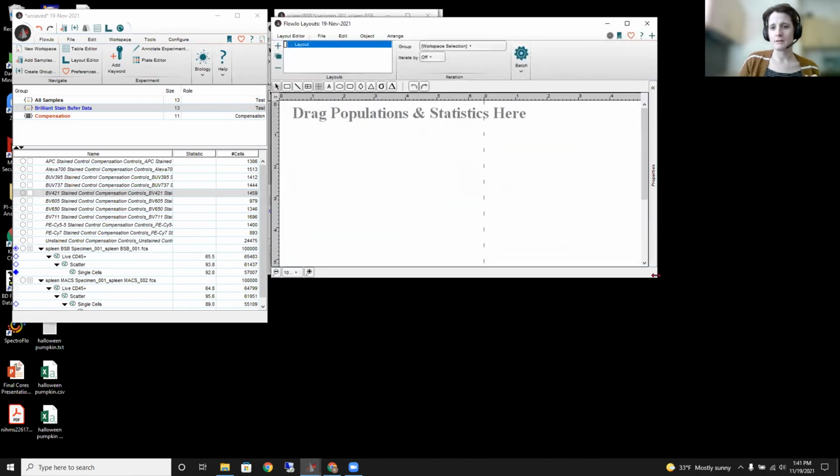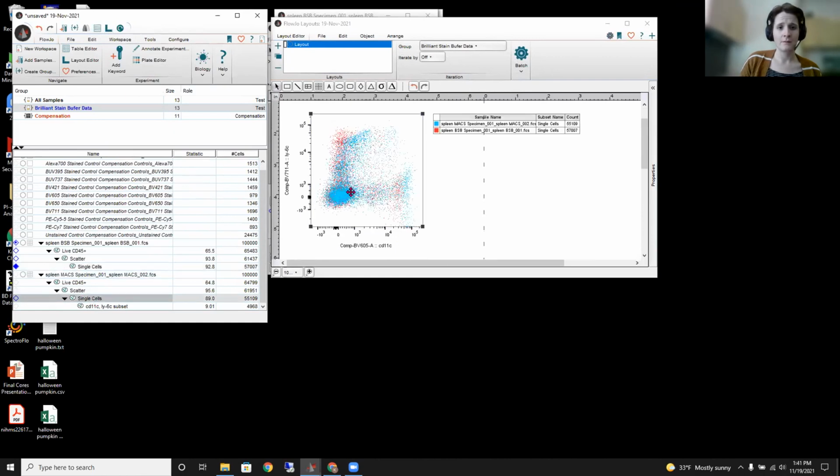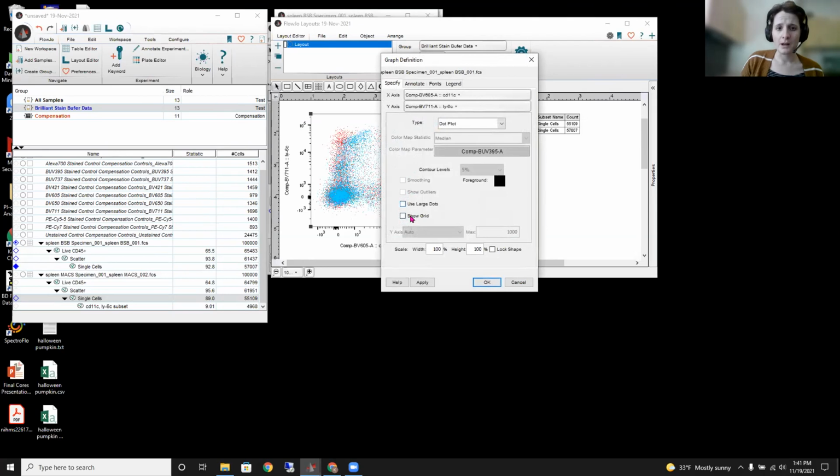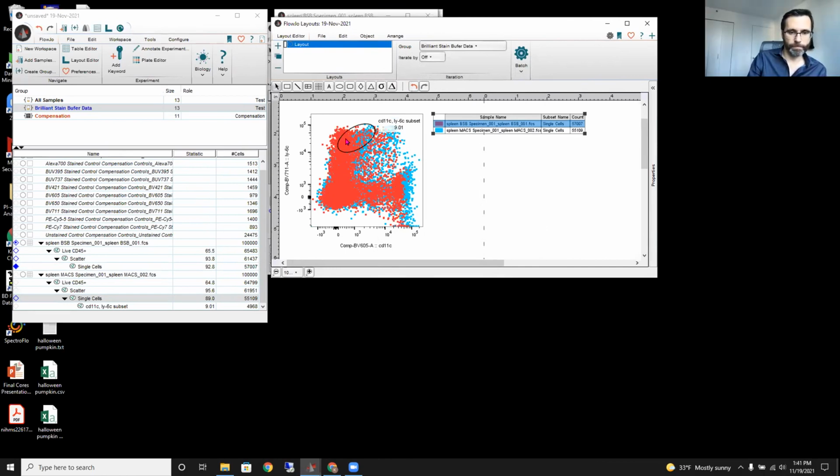And before I pass it back along to Derek, I'm just going to show an overlay of those two populations, or of those two FCS files rather, to show the difference. Okay. If I open that up, I'm going to use some larger dots that can help show our point a bit better. It's a little bit messy when we look at it this way, but the important thing to note here, that some people might have questions about, is fluorochrome brightness, and is one brighter than the other? Now, these two are the same. And what's important to also note is that if it was brighter in one than in the other, for that BV711, it would actually show a pattern of overcompensation. So that's not something we'd expect anyway.